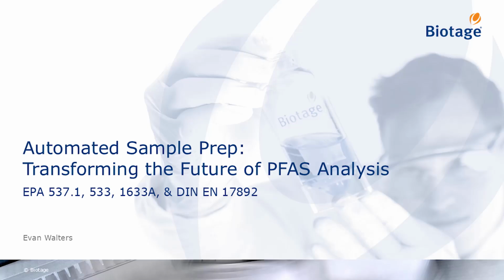Yes, thank you for the introduction, Janet. Today we will be discussing automating sample prep for PFAS analysis and comparing some of the previous EPA methods along with the newer EPA methods such as 1633, alongside the newest DIN EN method 17892, all looking into what automated platforms we can utilize for the sample prep.